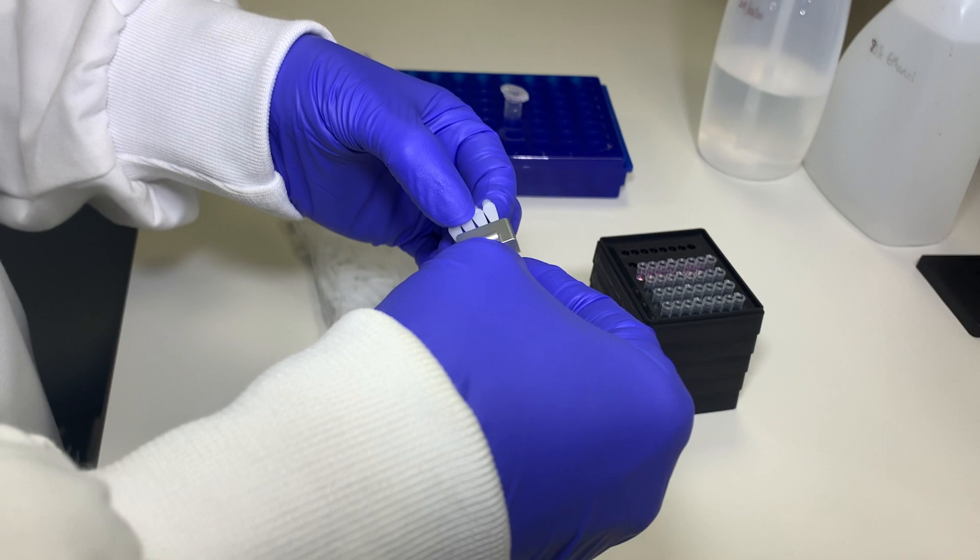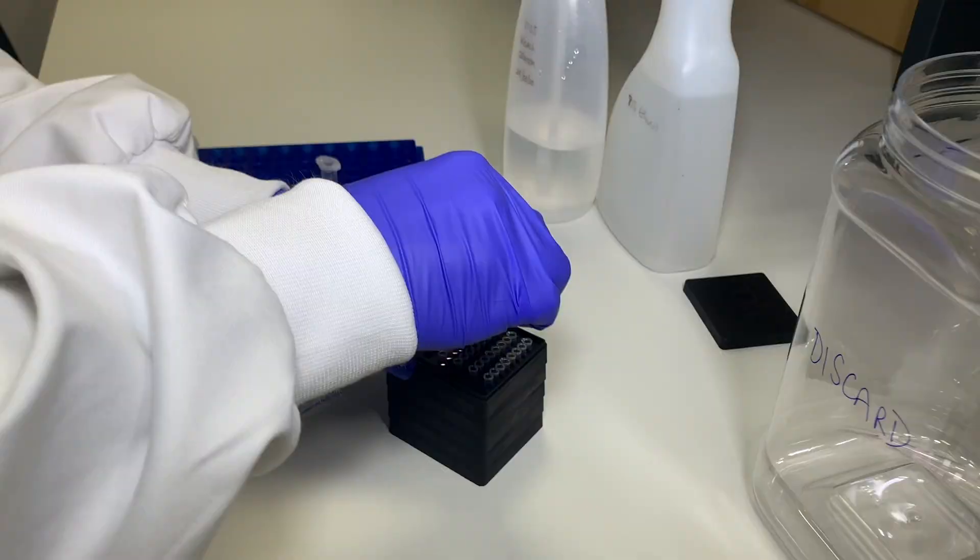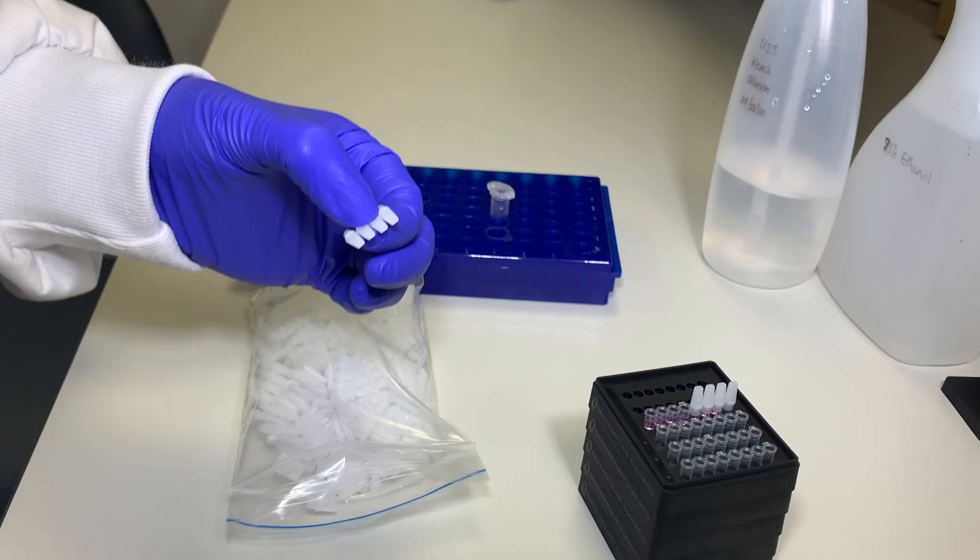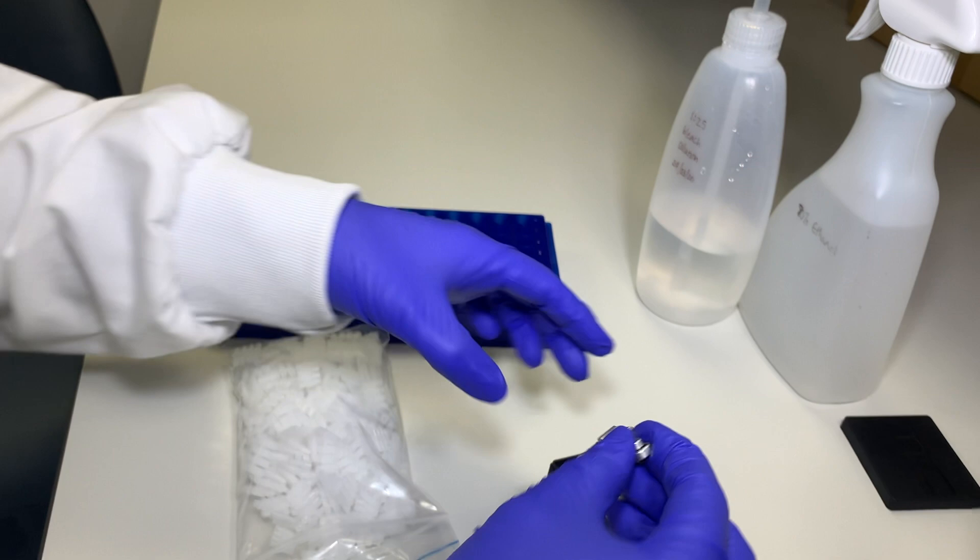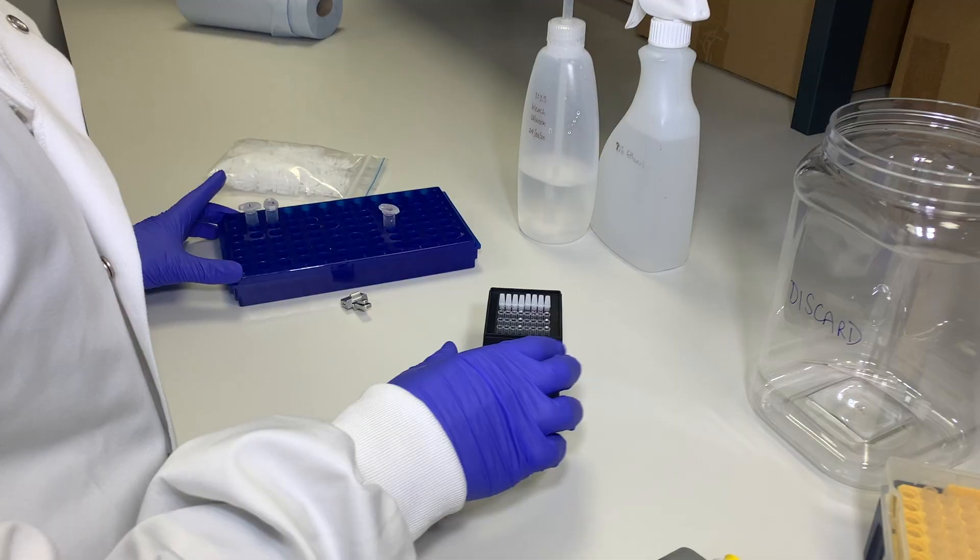Carefully take out a strip of lids and insert the pointed tops into the lid tool. Place the lids over the first strip of tubes and push down firmly to seal. Open the lid tool to release. Repeat for remaining tubes.